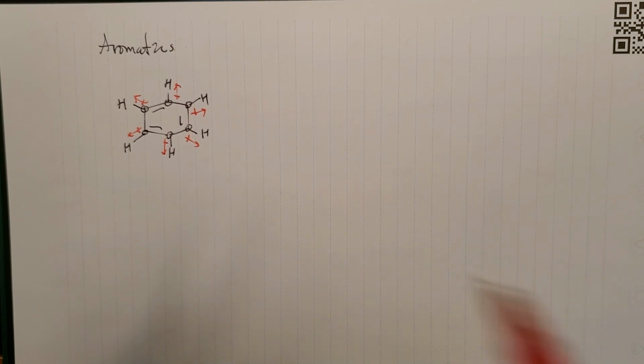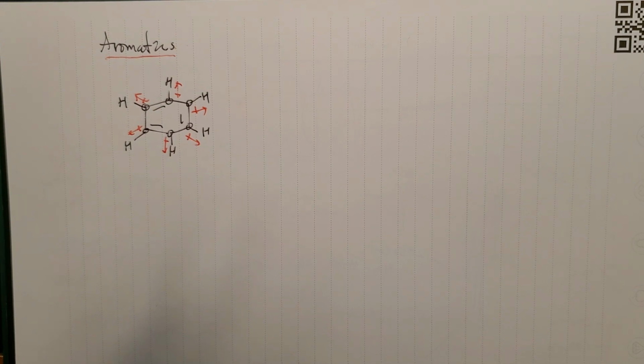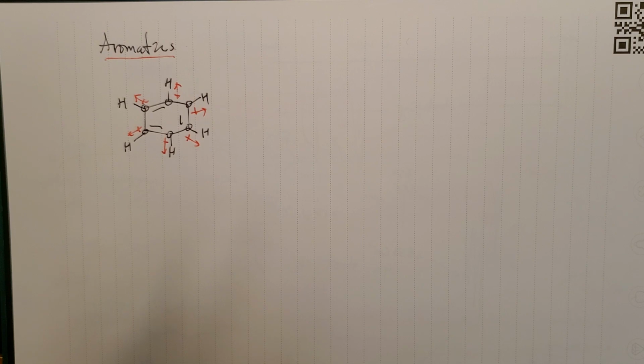All right, now let's talk about aromatics. You know, multiple times you will find difficulties telling apart these aromatic signals from the alkene signals.